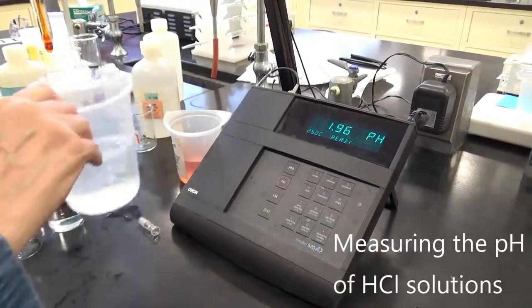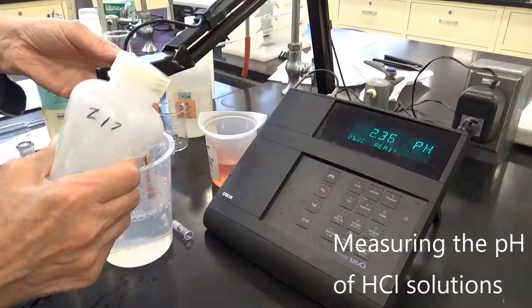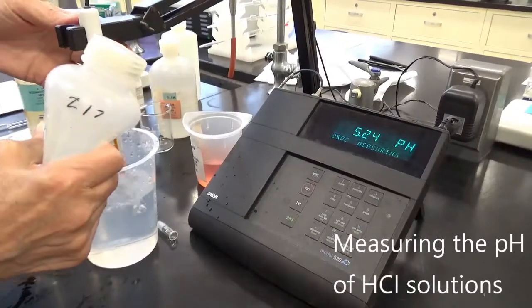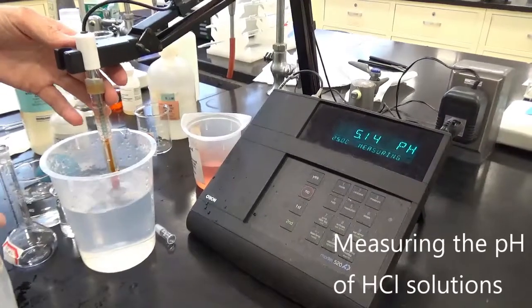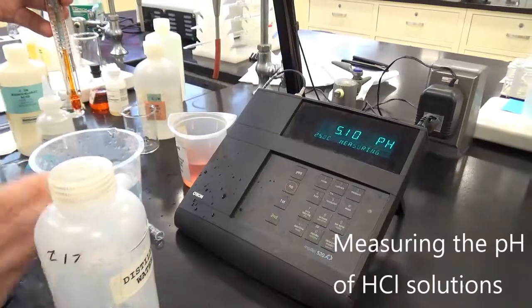Okay, now again, I have to rinse this very well. I probably should have measured the most dilute one first. Okay.